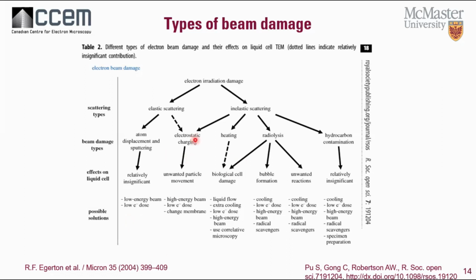The electrostatic charging can be due to both elastic and inelastic scattering, although inelastic scattering has a dominant effect. In liquid cells, charge can build up on the silicon nitride membrane. Such surface charge not only interferes with the incoming beam, but it can also induce unwanted particle movement within a liquid due to repulsion.